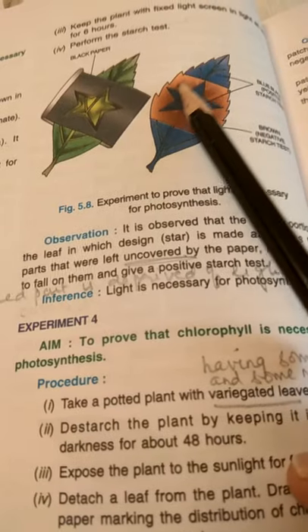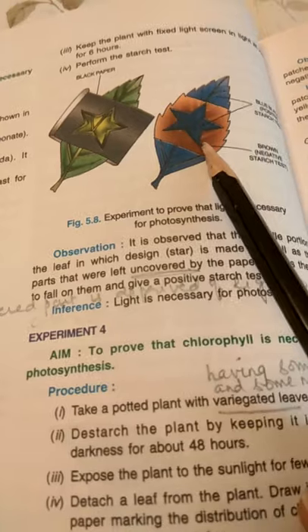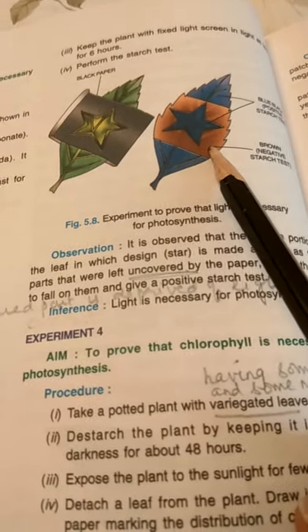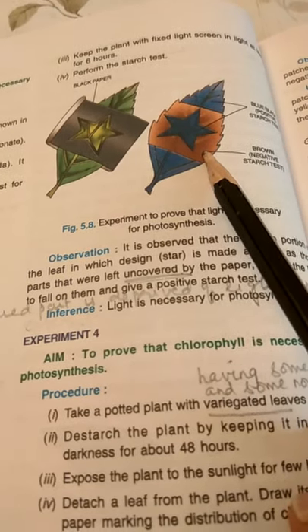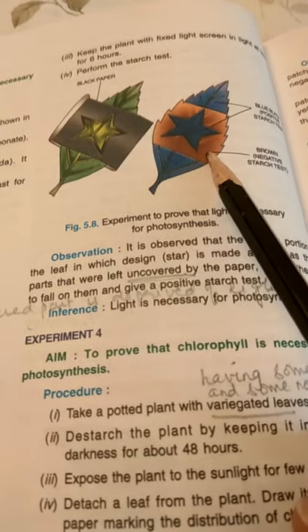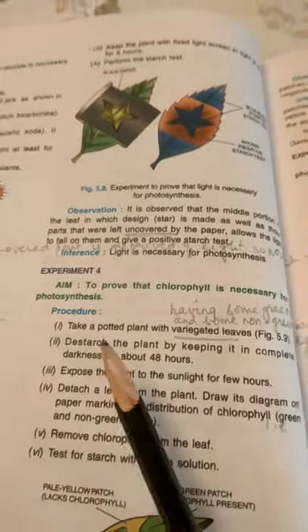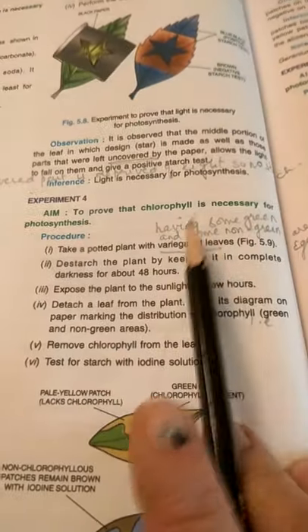The covered part surrounding the star design was not getting light and turns brown in color with iodine, proving that no starch formation has taken place. This proves that light is necessary for photosynthesis. Now I'll take the fourth experiment to prove that chlorophyll is also necessary for photosynthesis.